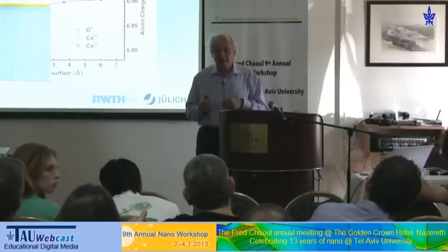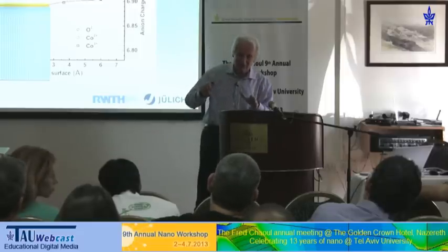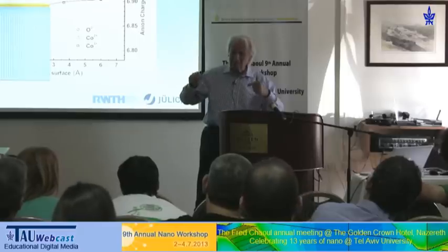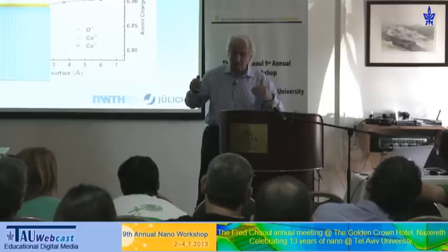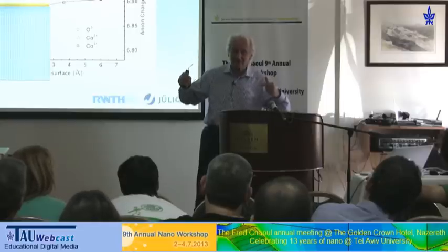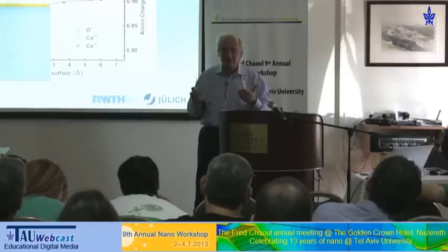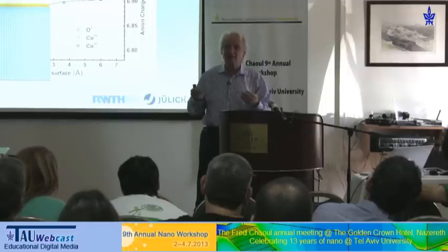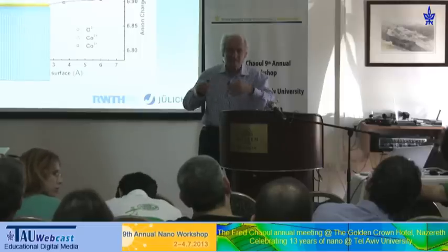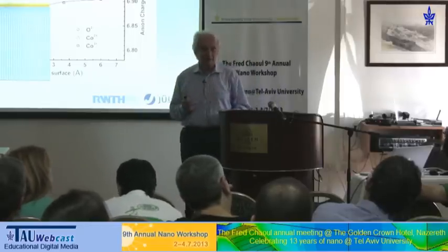What about glassy materials? I mean, glassy materials can be out of silicon, right? Right. So this was the organic materials part, because people have investigated organic materials at lower and lower electron energy. And it turns out that when you go to lower electron energy, then you gain in the applicable resolution. And this is a development going on at the moment, that you now go to lower electron energies.